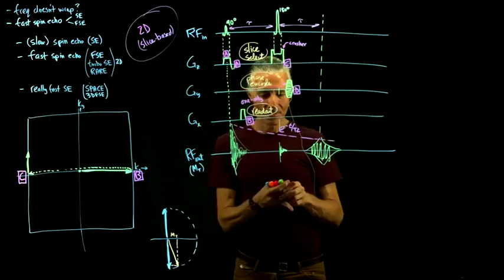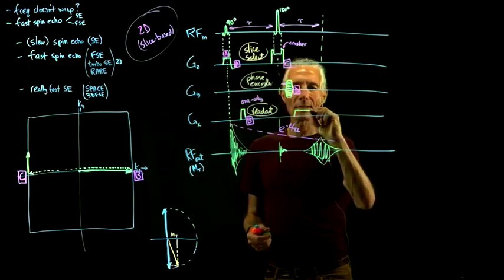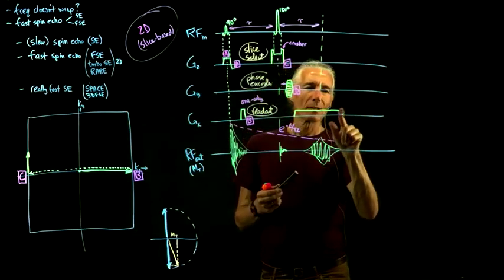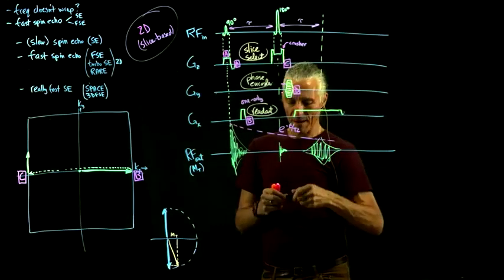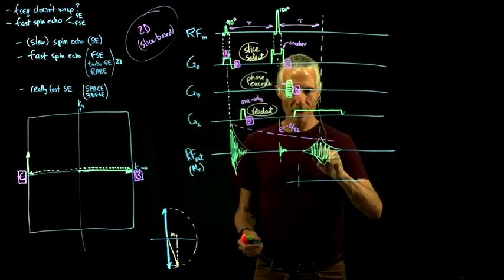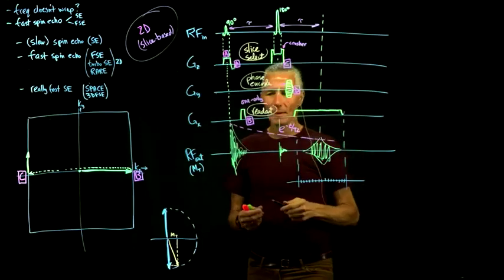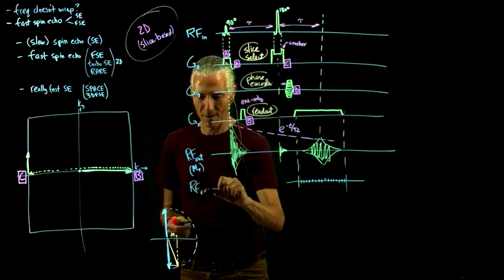And then we do our readout. And so here's our readout like that. And then we record our data. So finally we're recording. So now we're recording. So here's all our data points. Like that. So this is RF, record. We don't have the recorder on the whole time.